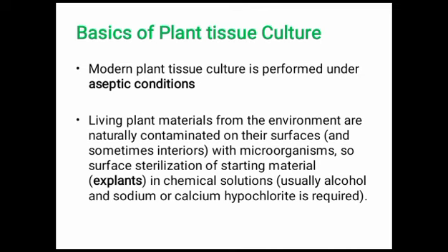When we select the mother plant, we can select any part of the plant and cut it into the smallest pieces, called explants. Before starting the culture method, or before transferring into the artificial medium, the explants are sterilized. Why is this important? Because after sterilization, the explants are totally free from dust and other microorganisms. That is why sterilization is very important before transferring into the artificial medium.